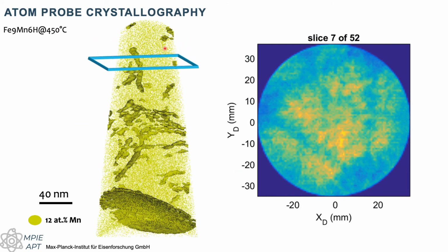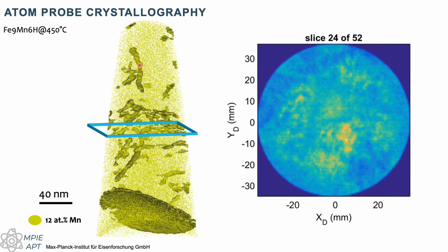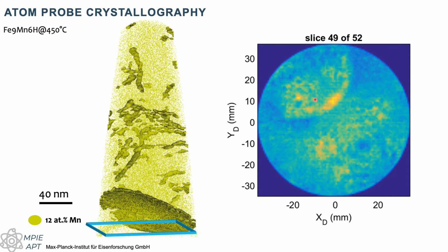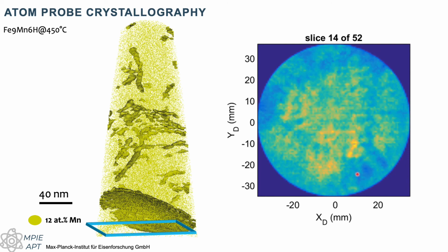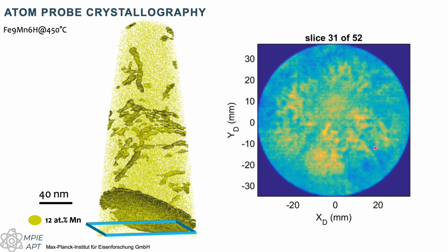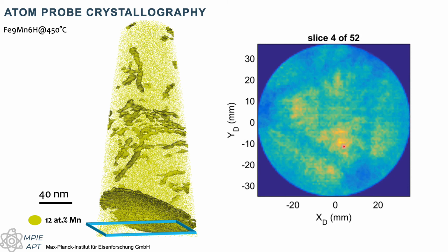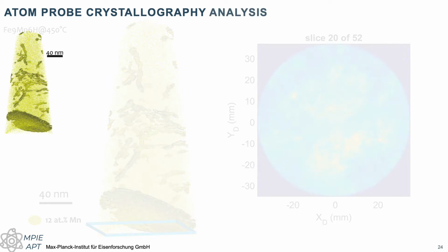Now, if I go through that one dataset from Allison, Kwiatkowski, da Silva, you can see I was in the first grain, the pattern was whatever it was. Second grain, the pattern is not completely dissimilar with a series of poles. And then as I reach the end there, I'm going into a third grain. And so here you can see these three poles, which are all 110s. The 111 pole is right there in the middle. I have now gone through the grain boundary, which is a low angle boundary. I'll get back to that. And now I'm in the bottom grain, after we've traveled through a high angle boundary. Again, quite a lot of information.